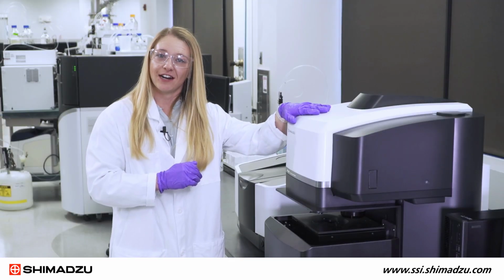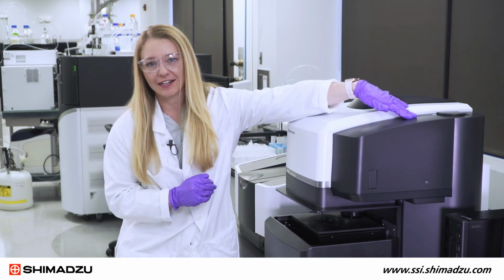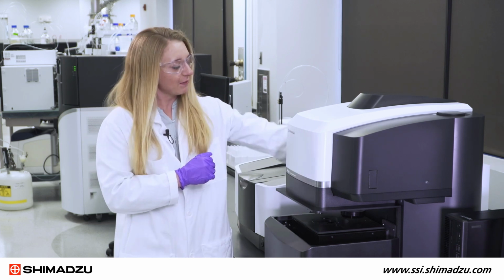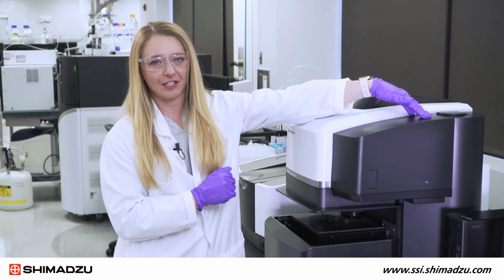For transmission IR microscope measurements, the IR beam starts in the back corner, comes to the front, goes through the sample, and to the detector in the back. For ATR and IR reflection measurements, the beam starts in the same spot, comes to the front, reflects off the sample, and back to the same detector.